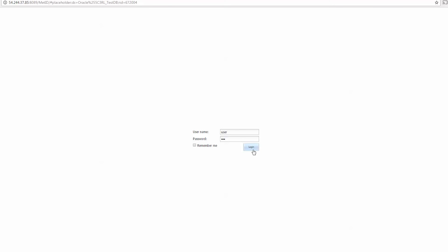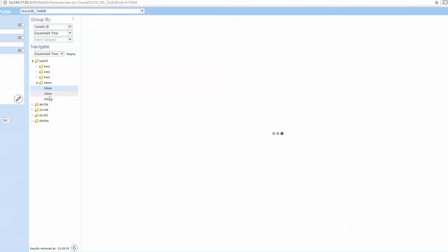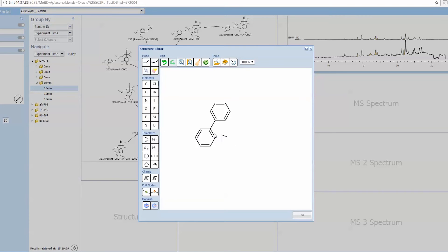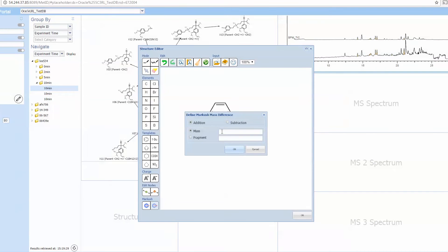It also has a web portal. You can search through all your records, or we have a fully integrated structure drawing tool where you can have Markush structures as well.